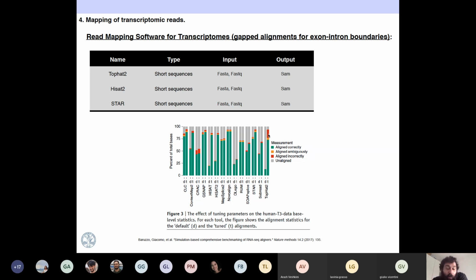And then you check if you have more mapped reads. So that would be an easy way to tune them. You just change parameters and you see if you increase the number of reads that you are mapping. Again, imagine that you run the first map and you get 80%, and you say, I can live with 80%, or I would like to scratch a little.